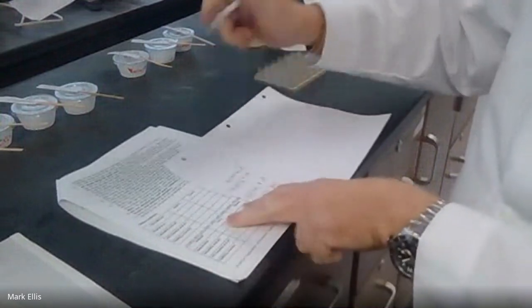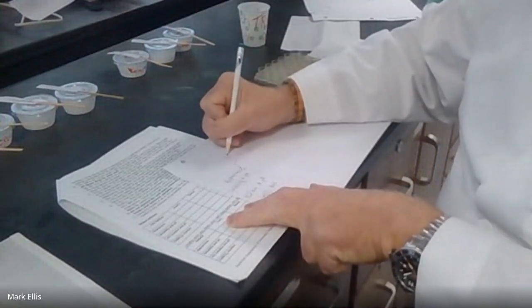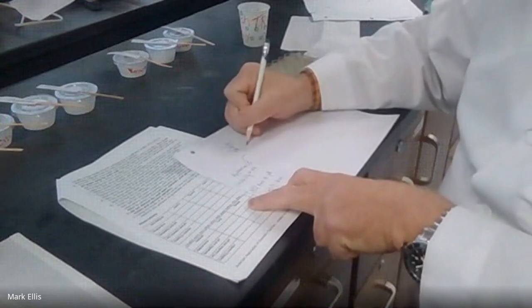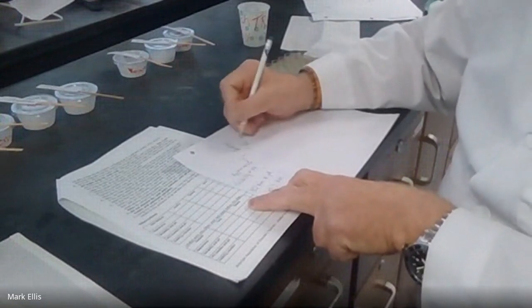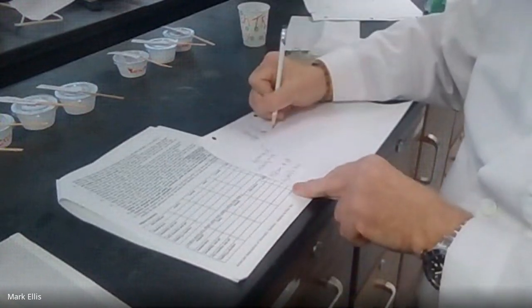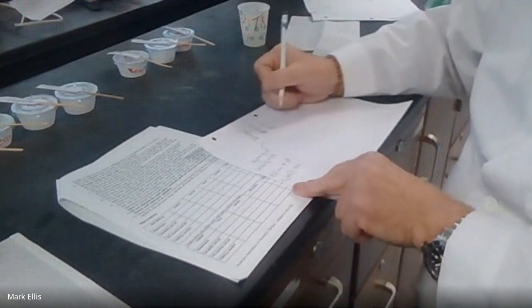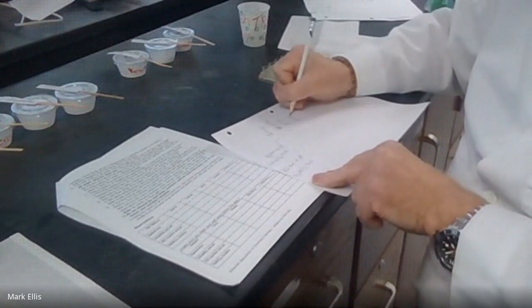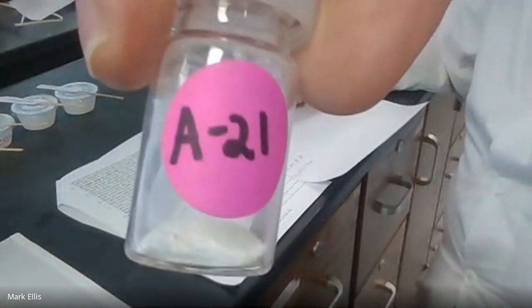The columns, we'll do Tums in the first one, just like what's on the chart here. Rolaids in the second column. I spelled it wrong. Rolaids. Alka-Seltzer, I'm just going to abbreviate AS. And then my unknown. And my unknown for the antacids has an A in front of it. So this is A21.